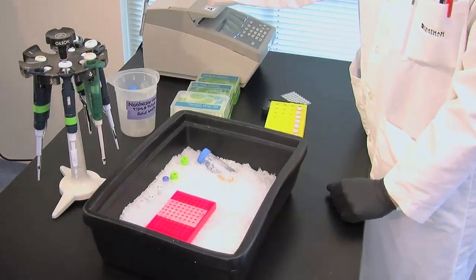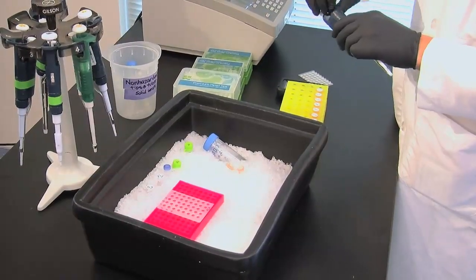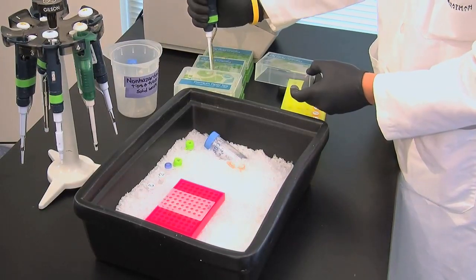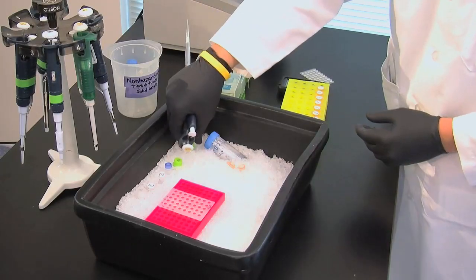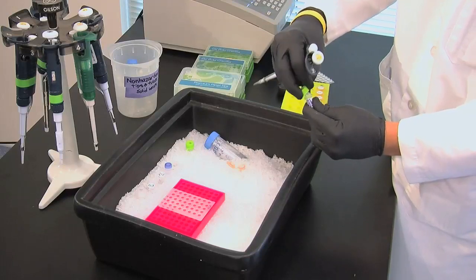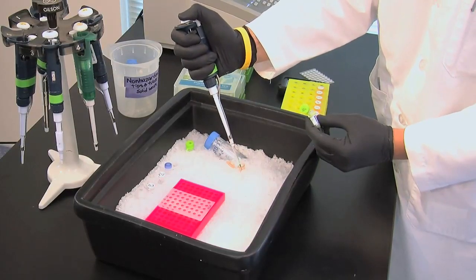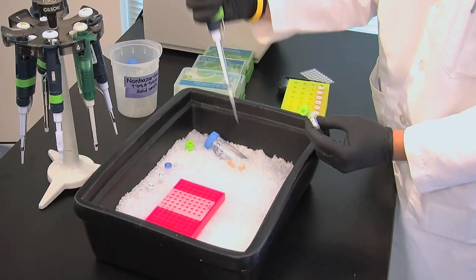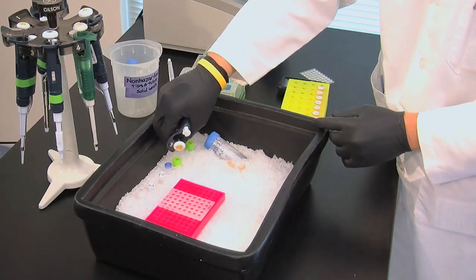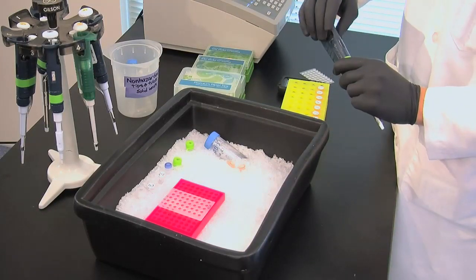Throw away the tip. Then, add 100 microliters of flexi buffer and 30 microliters of magnesium chloride.